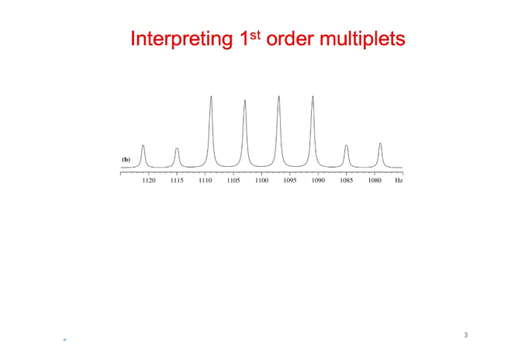A doublet. Yeah, so we have a doublet component over here, right? And that's the same distance as this, and this, right? So we have a doublet, and I guess we could draw it the way they did here.